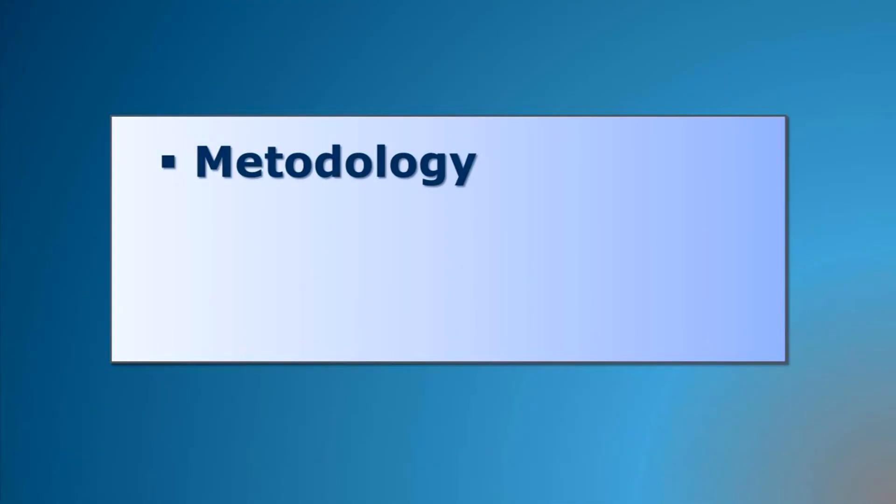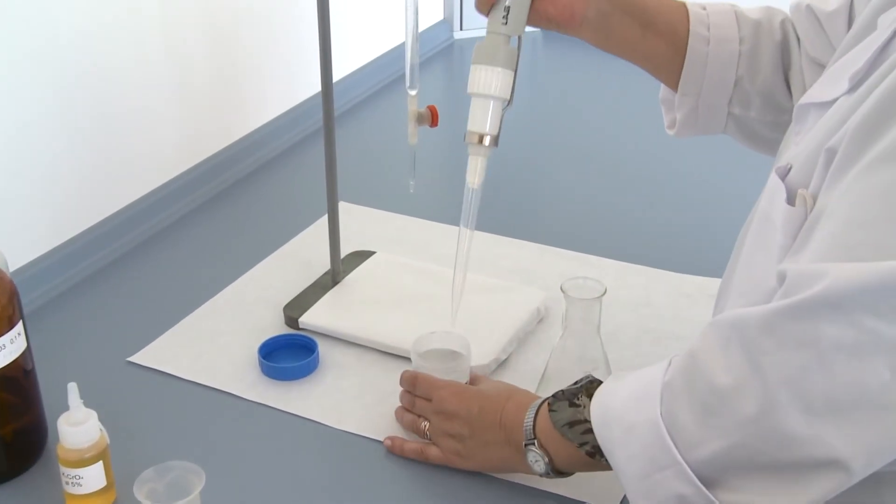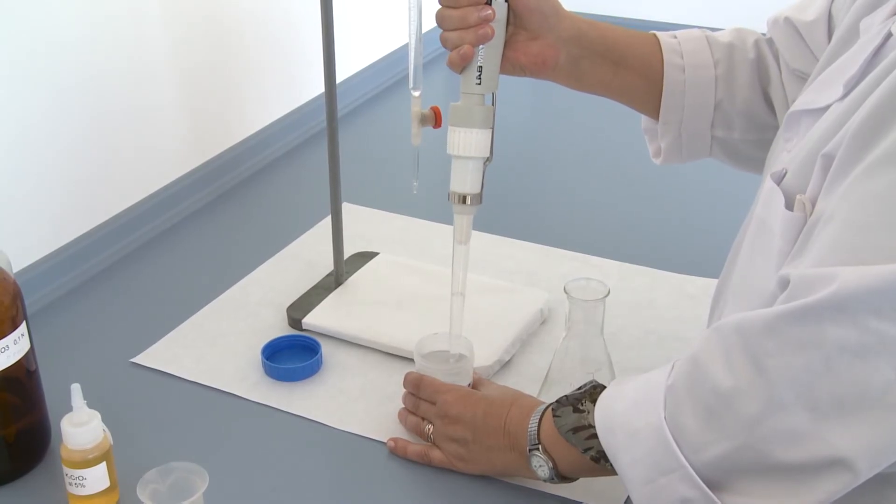Methodology. Measure with a pipette 10 ml of water sample and pass it to a 250 ml Erlenmeyer flask.